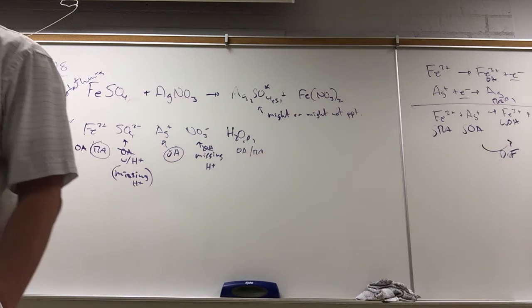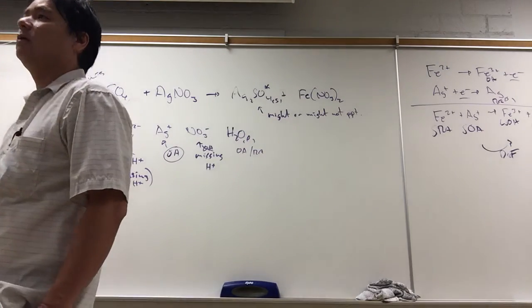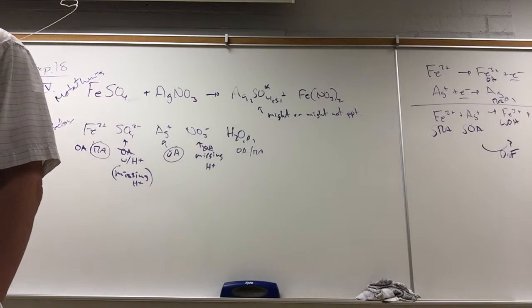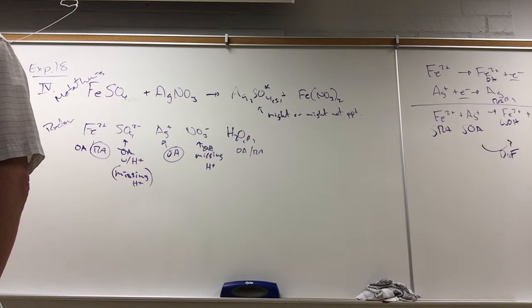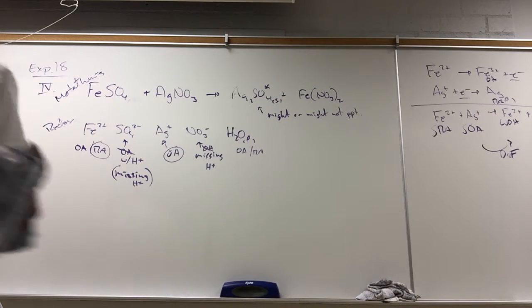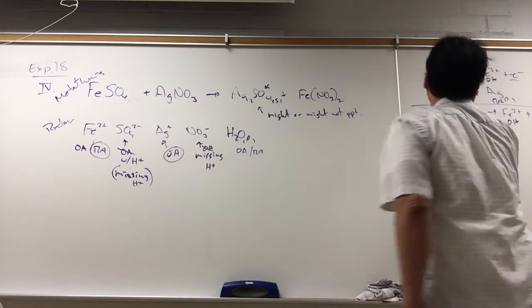All right, so that was number 4. Now go to number 3 and do that, and then number 3 is a bit more complicated. Maybe I should do that one. What is number 3? Copper and bromine. The reason it's a bit more complicated is because after you do the initial reaction, there are more reactions that you do.